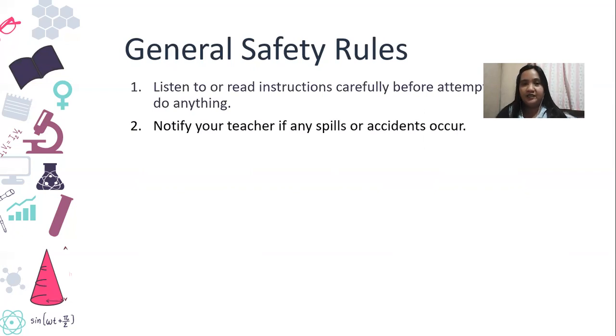Okay, just in case you're out on your own doing your experiment, and I'm in another group or in another part of the room, you have to notify me of any spills or accidents. Do not hide any spills or accidents. In any event that there should be something out of the ordinary, if there's a spillage, or there's a breakage, please let me know.